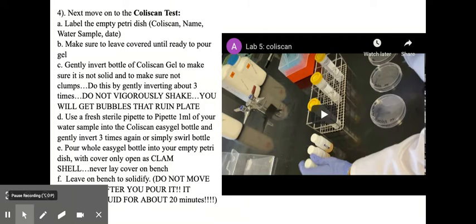So it's a one step method that lets us distinguish those and see if they're present in our water sample. So we would start by labeling the empty Petri dish, labeling it with the coliscan, your name and the water sample letter and the date. And make sure to leave it covered until you're ready to pour it so it stays sterile.